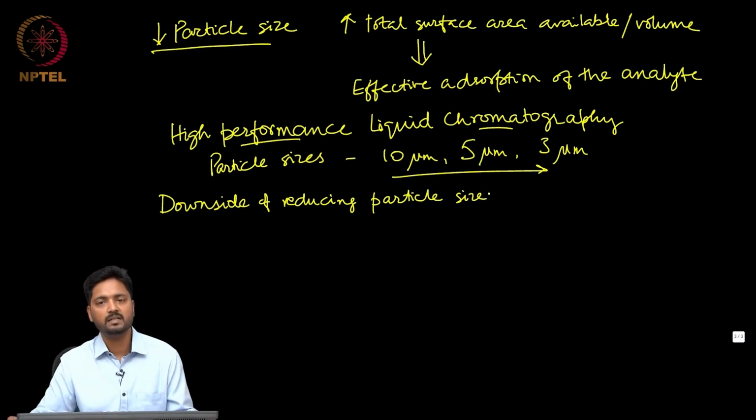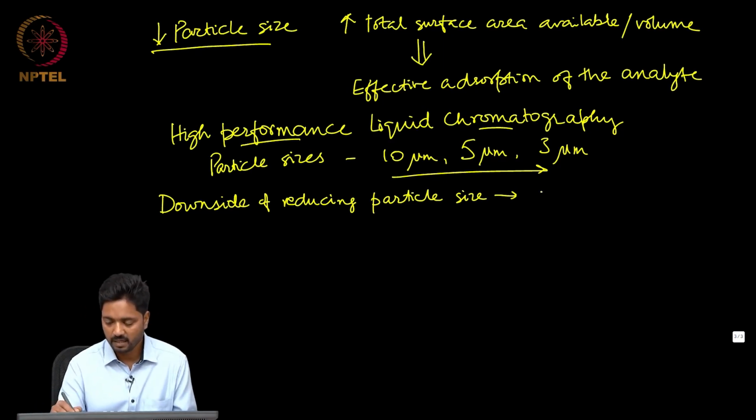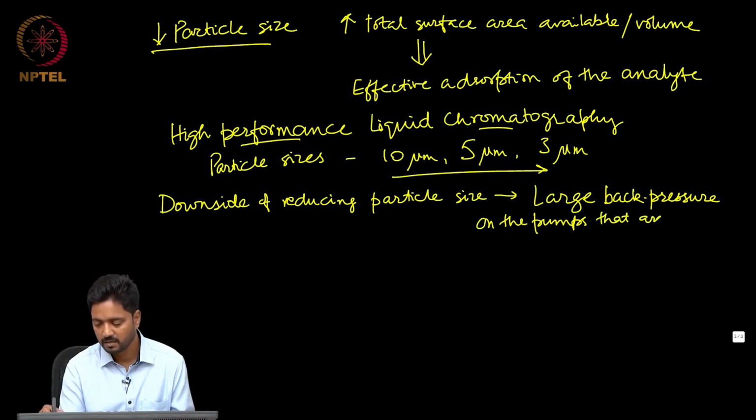And the downside relates to the fact that we create a large back pressure on the pumps that are pumping the eluent or the mobile phase.